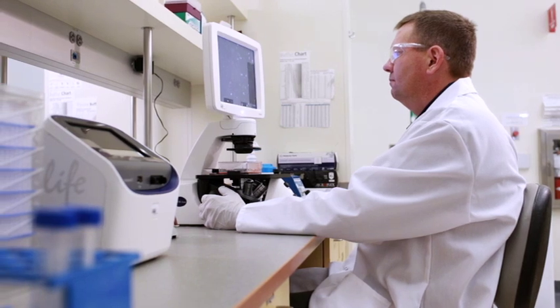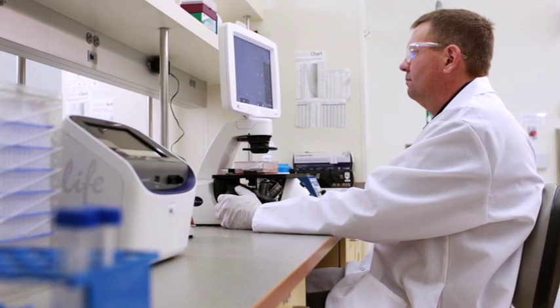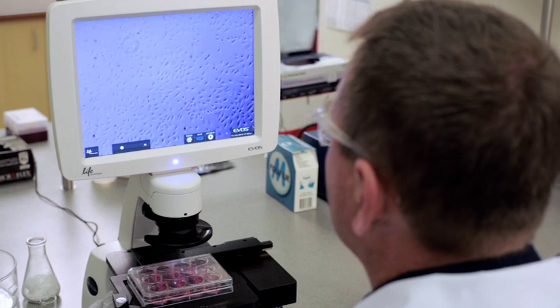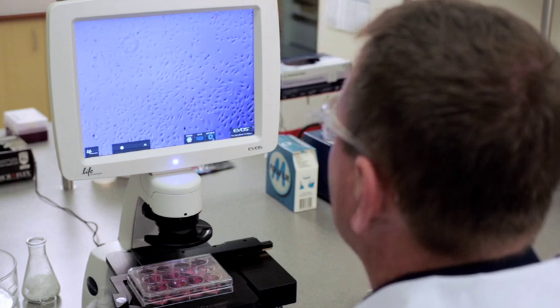Evo's imaging systems are designed to remove the complexities of microscopy, so you can focus on your data rather than instrument operation and maintenance.